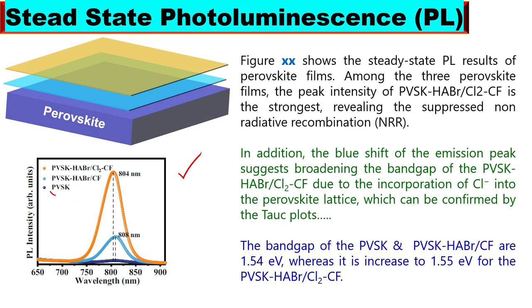Here we have three samples. The first one is basically the perovskite. This is the perovskite layer here. In your case, this may be a different material. So we can see here, this is the curve, with a very low peak. This is the curve for the perovskite. So we want to see what happened when we add this extra material to the perovskite.